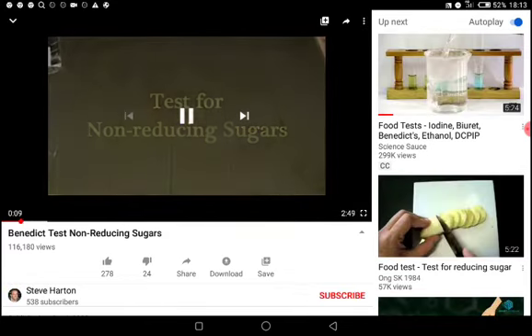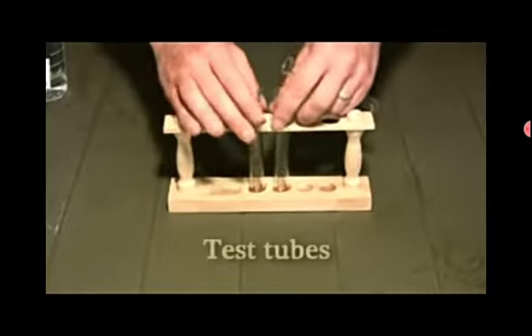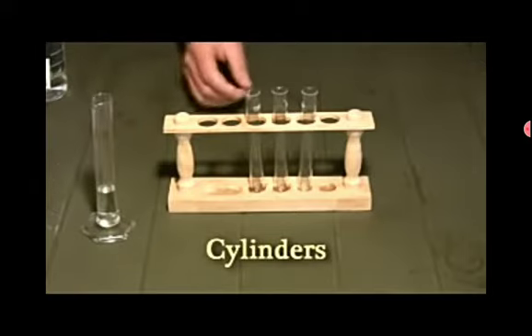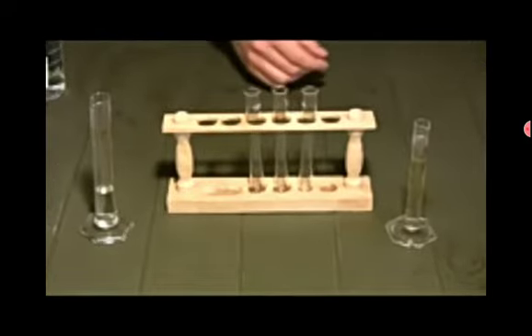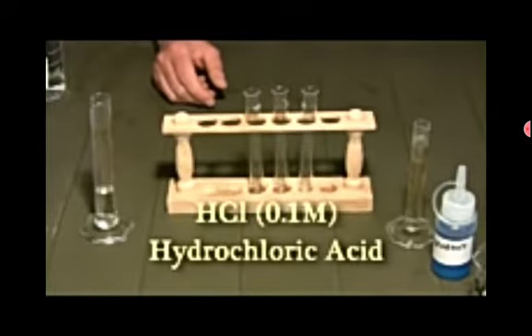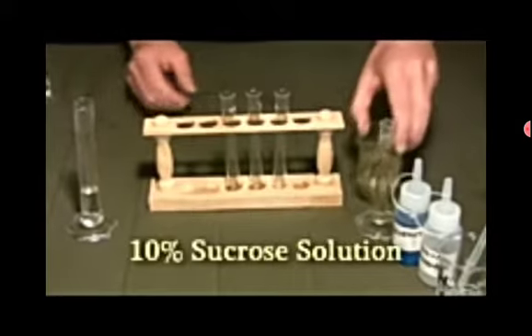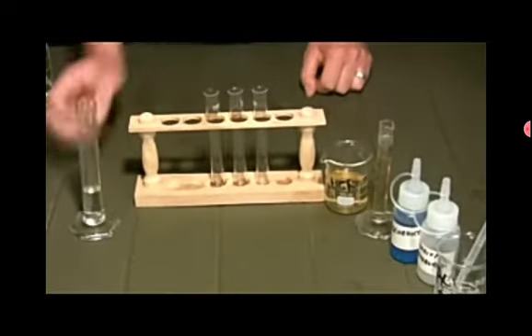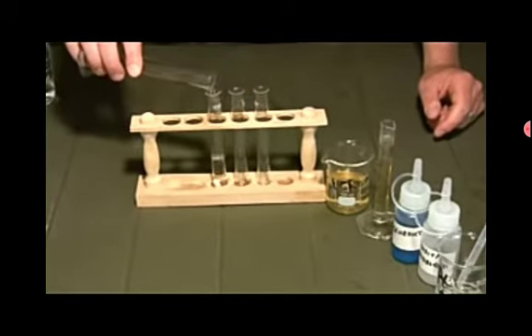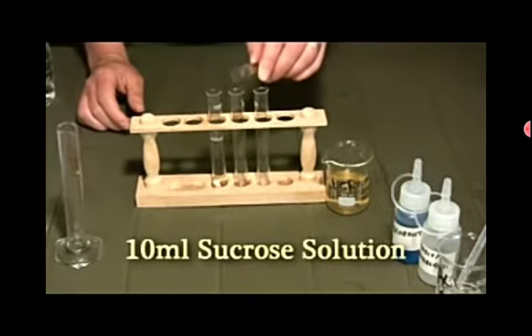Test for non-reducing sugar. You need a test tube rack, 3 test tubes, some cylinders, again, Benedict solution, hydrochloric acid, sodium hydroxide, and some sucrose solution. Okay, let's add 10 ml for our test control, the water. Then we have our sucrose solution, 10 ml.